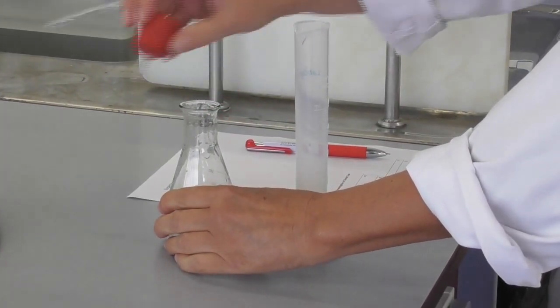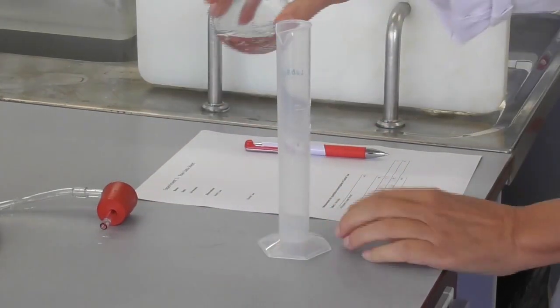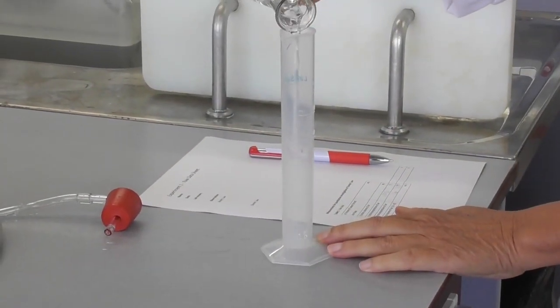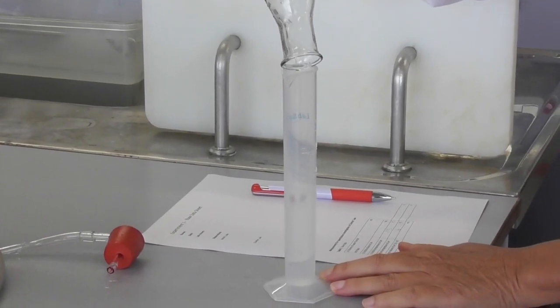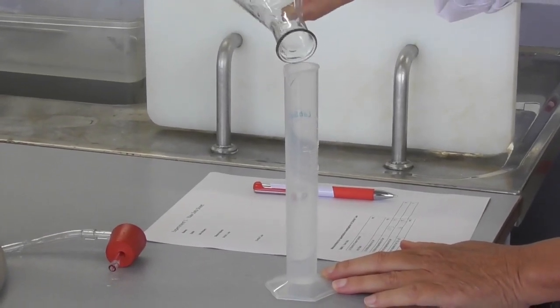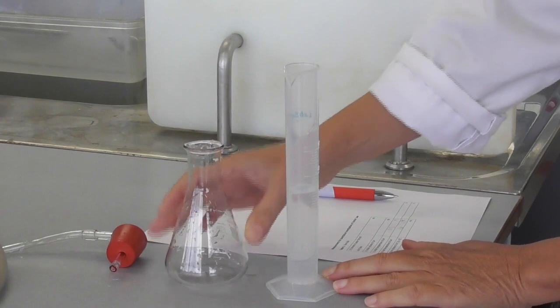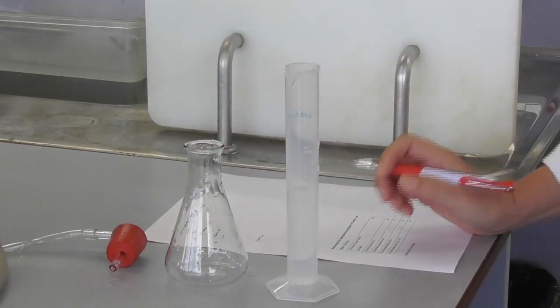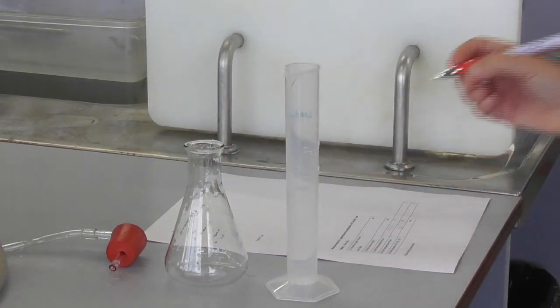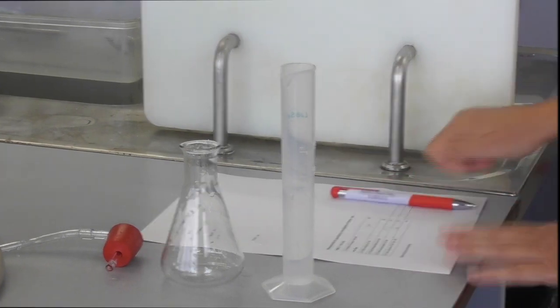To determine the volume of this water we pour the contents of the flask into a measuring cylinder and read the volume, and write this down on our sheet.